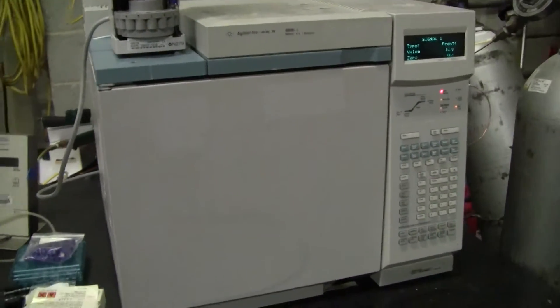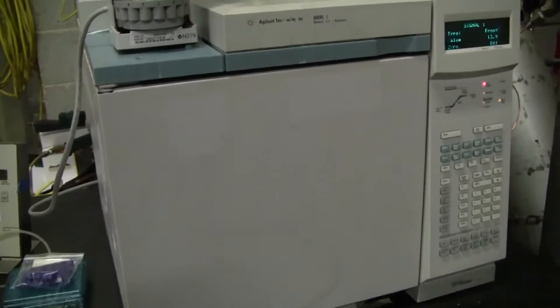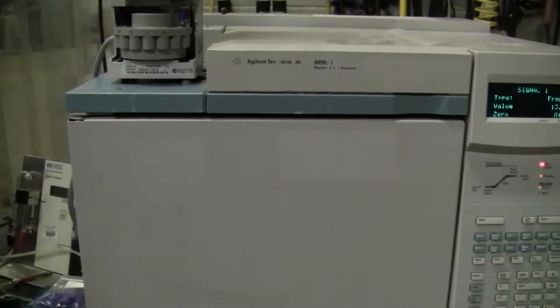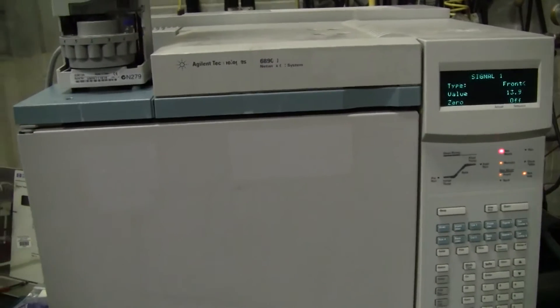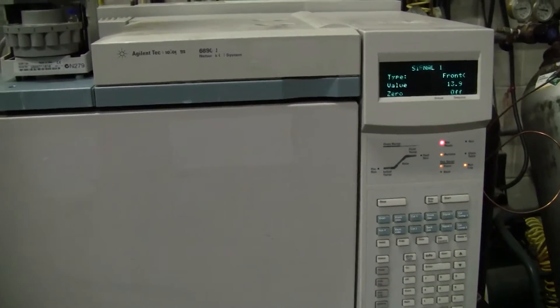Hi, this is Michael from HitechTrader. Today we're looking at an Agilent 6890N networked GC.